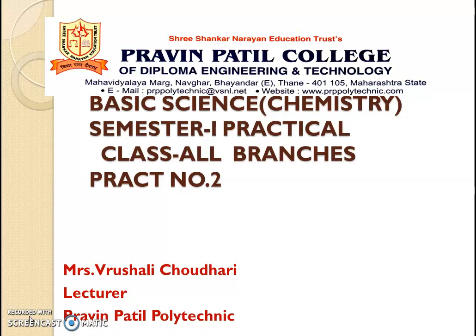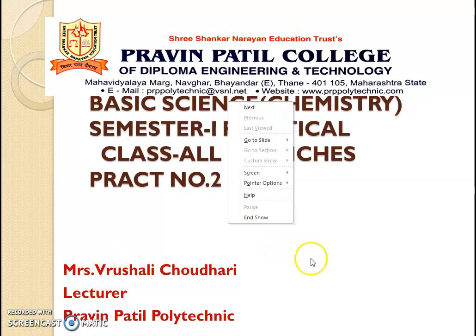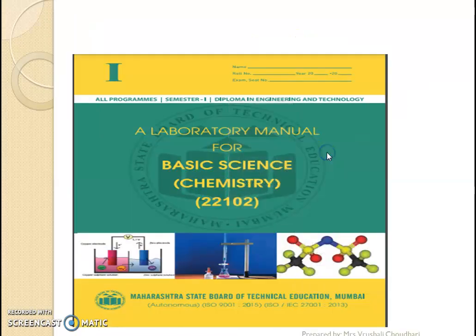Today we are going to learn practical number 2 for basic science, basic chemistry. This is your manual.